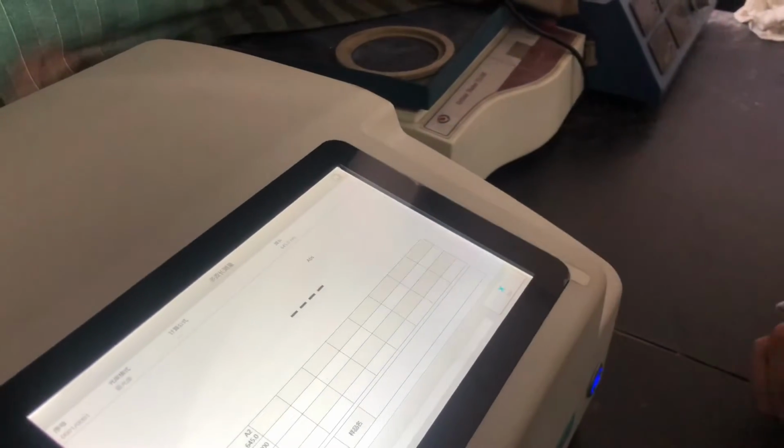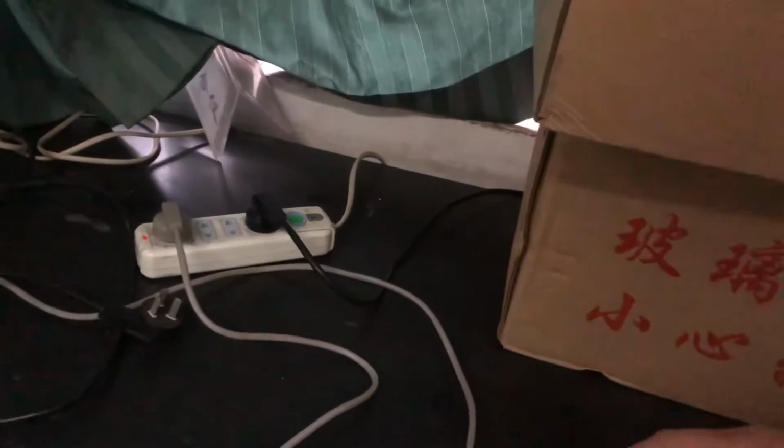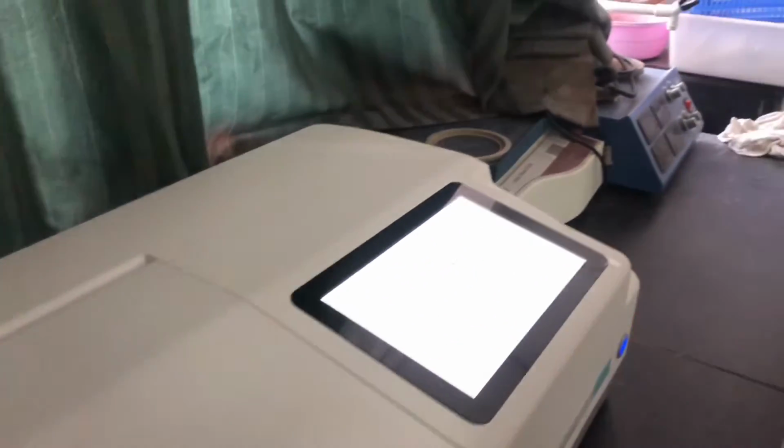Close. This one I can write down. Okay. I will help you. I will write down this number and the last. Okay.